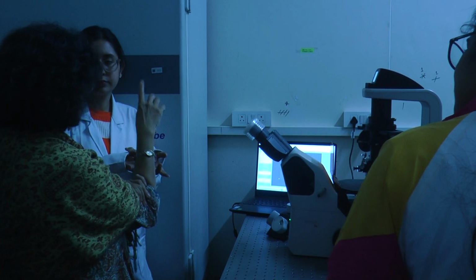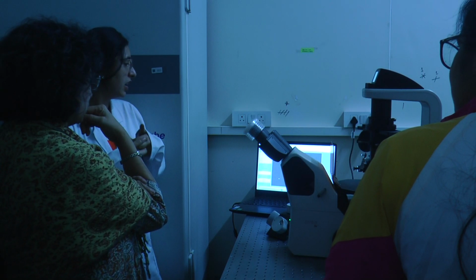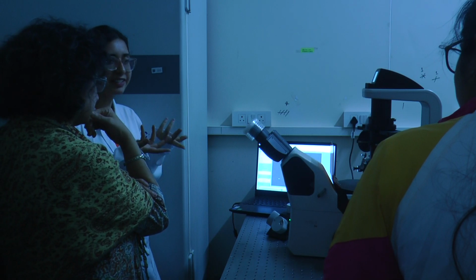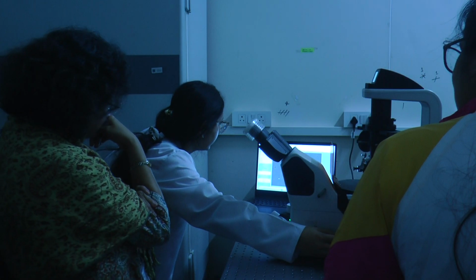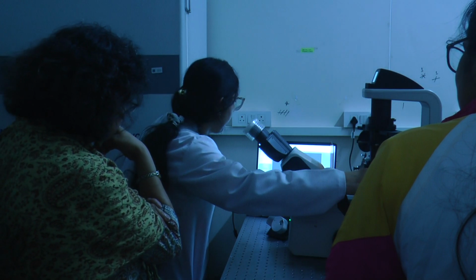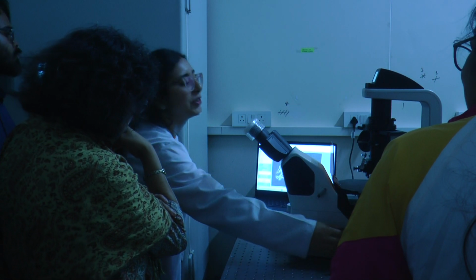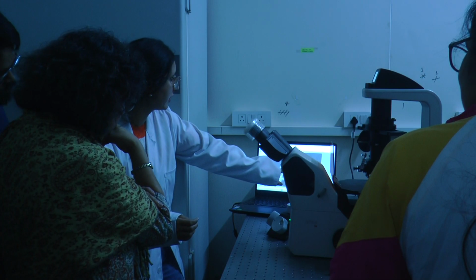So what would have happened to the one which is less contrast? Less cytoplasm? Maybe. Maybe, we can assume that. So one thing is we have to always move with the hand because the stage is not compatible with these bigger sizes.